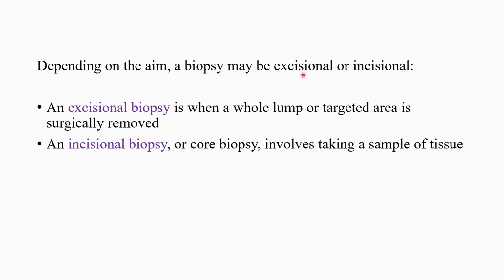Depending on the purpose, a biopsy can be excisional or incisional. An excisional biopsy involves surgically removing an entire lump or targeted area, allowing complete examination of the tissue. In contrast, an incisional biopsy, also called a core biopsy, involves taking only a small sample of tissue for analysis rather than removing the whole lesion as in an excisional biopsy.